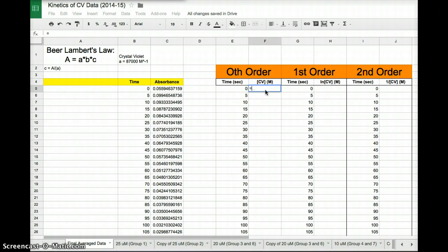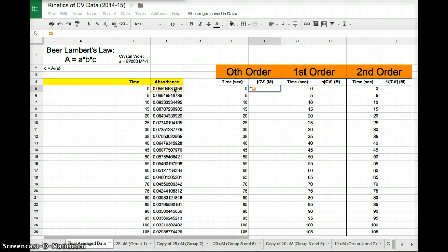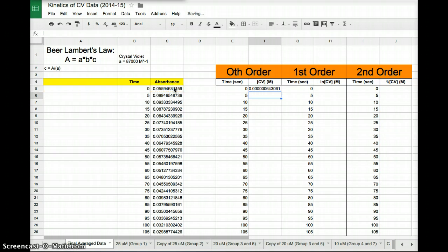We want it to be equal to the absorbance divided by the absorptivity constant. So I'm going to take this number, that's my absorbance, C5, divided by 87,000. I'm going to type that in and I'm going to hit enter. Boom.